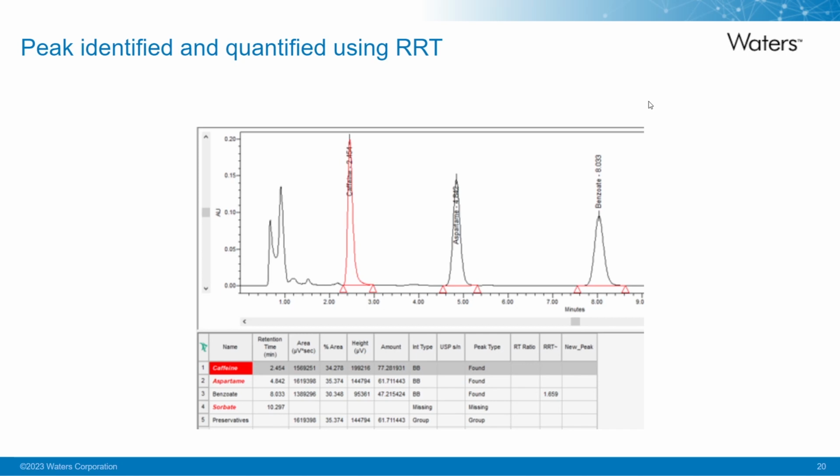So again, we know there can be movement of peaks, shifting of retention times from injection to injection, perhaps even over long sample set methods this can occur. But there are some tools in Empower that you can take advantage of to make sure that the peaks are identified and quantitated. This way, it requires less manual intervention once all of the data has been collected and processed.